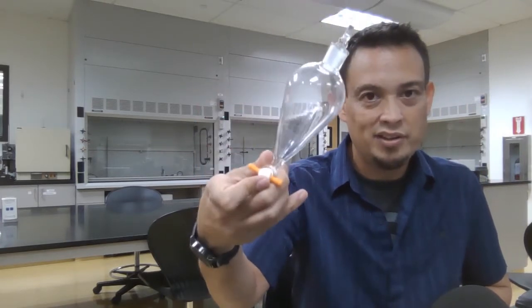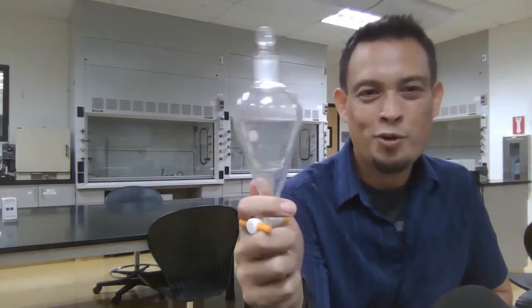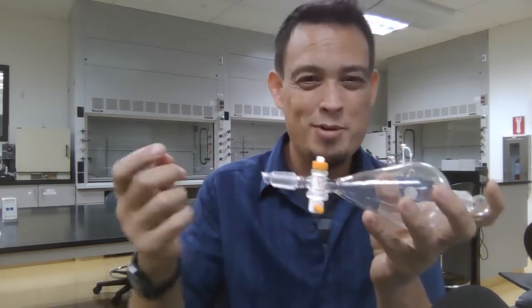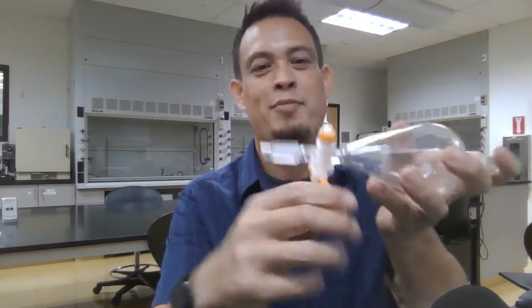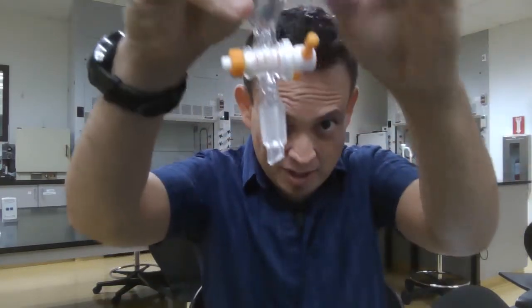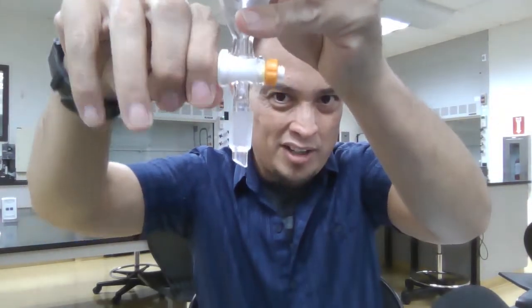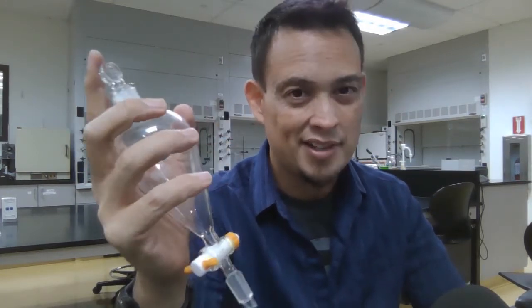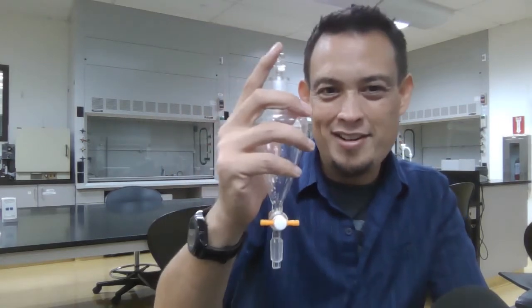Before we switch over to the experiment itself, I want to show you a few things about this piece of glass — our first time seeing one of these in this course. This is referred to as a separatory funnel. I'll often refer to it as a sep funnel for short. There should be an O-ring inside of here. We use this to open and close — there's a little Teflon plug here with a little hole that just turns to have it open or closed. You add your liquid from the top. Before you do anything of importance, I recommend you check it for leaks by adding a little bit of solvent, like ether or water. You don't want to be three hours deep into an experiment and then realize your sep funnel had a leak. Very bad news.